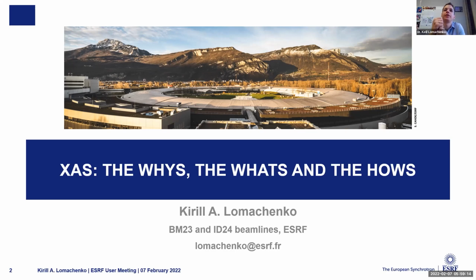And then you would be able to see it from XANES. So I would think that here the chance for you would be not in EXAFS, but in XANES, because you are more likely to see changes in the electronic structure rather than changes in the coordination environment. It's the same reason why, for example, in EXAFS we cannot see hydrogen neighbors, because it just does not scatter much. Lithium and hydrogen are very light.